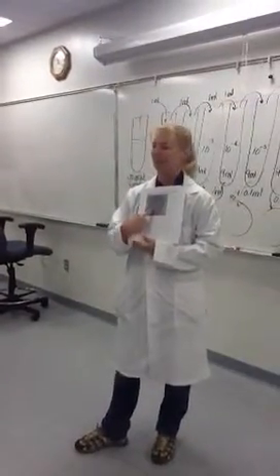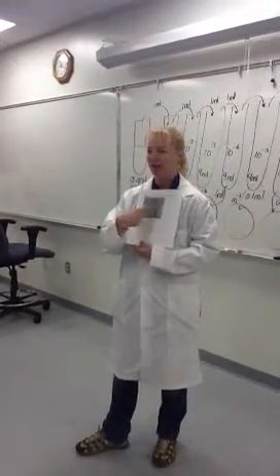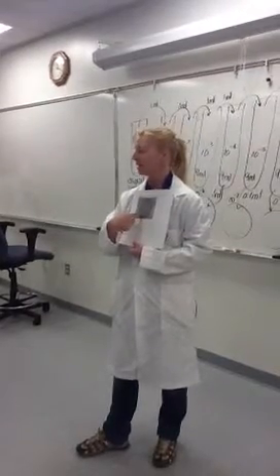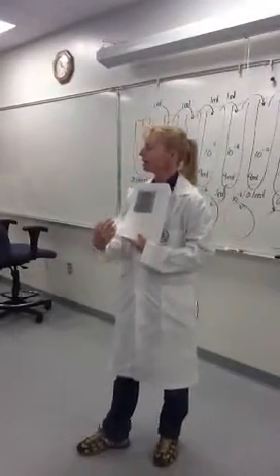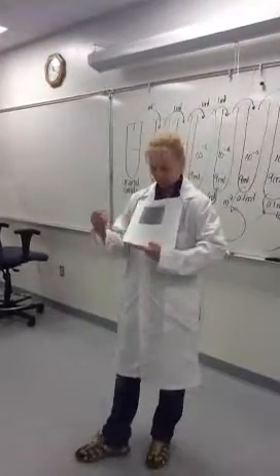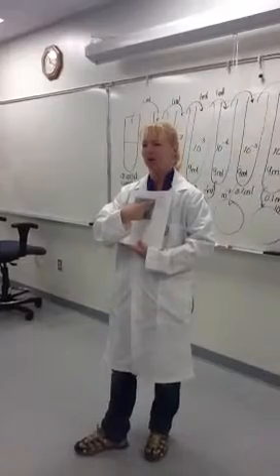On the back page here is a little plate that you actually get to do the counting on. The easiest way to do this is hit it with a pen, put a dot on each of the colonies on here. I do realize that it doesn't always copy off the best in there. Do the best that you can with it. It's an exercise in doing the activity, not necessarily on getting an exact count on here when we have the limits of the copy machine. The dilution factor is given to you at the top of the problem there.